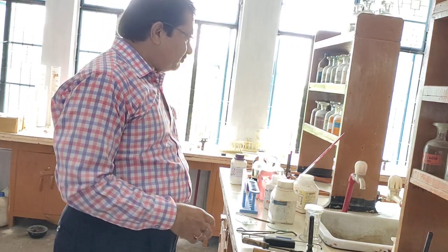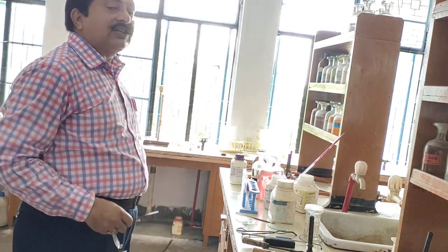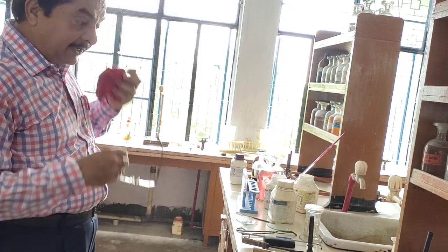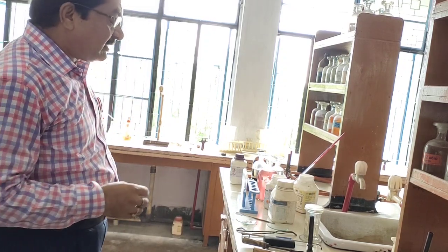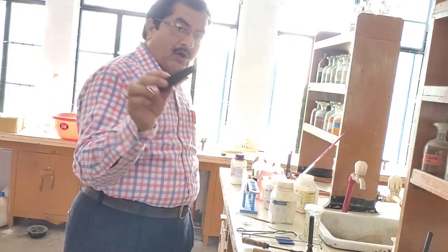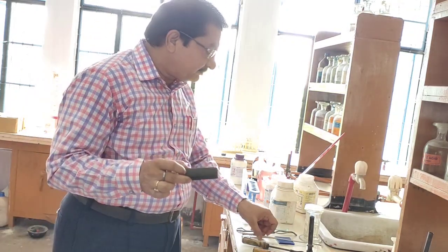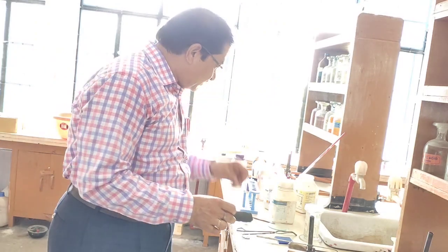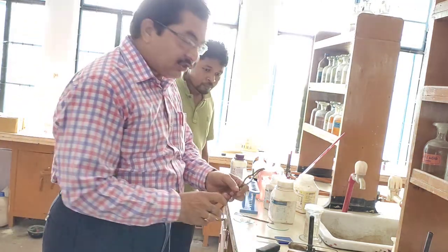Just after this, we are doing the charcoal cavity test. In the charcoal cavity test, you will see that first we are taking the charcoal block. This is your charcoal block, and this is your tongs.